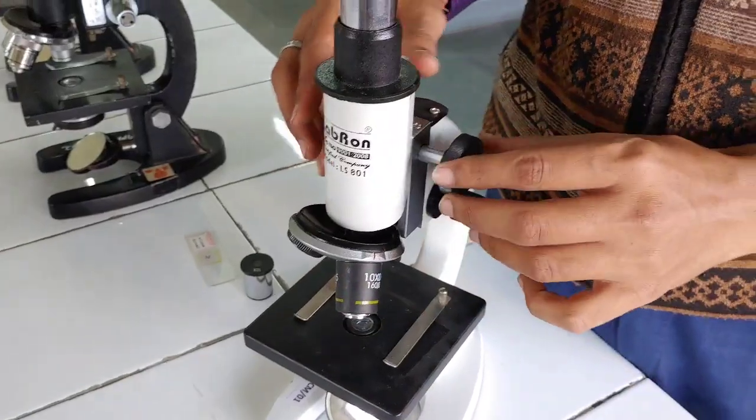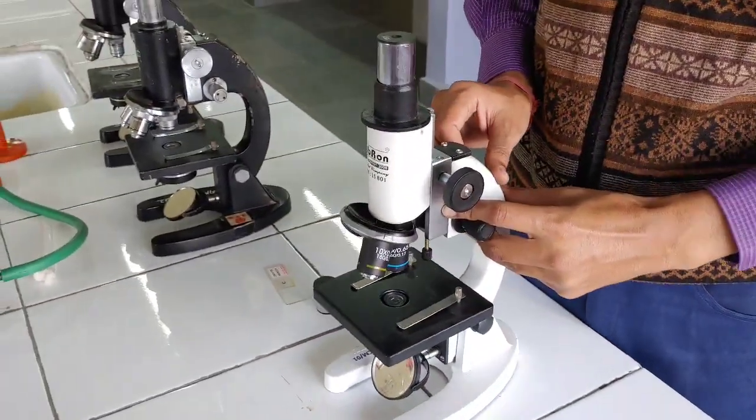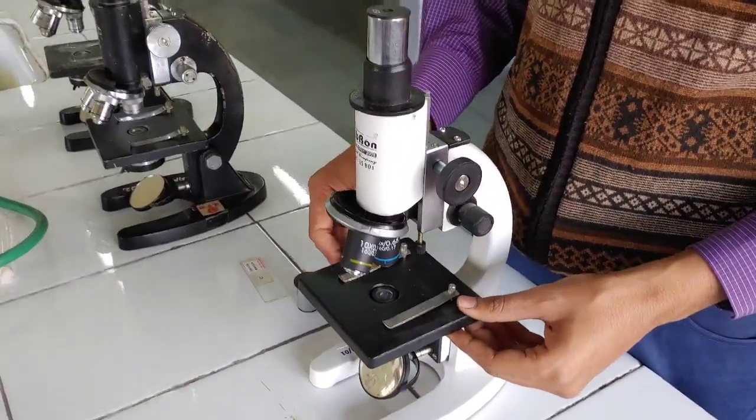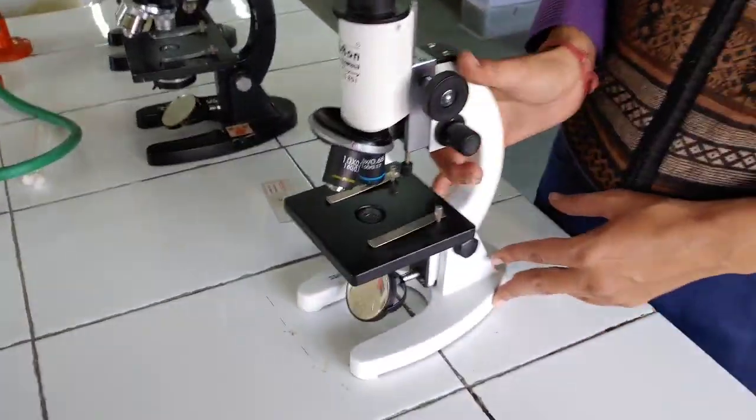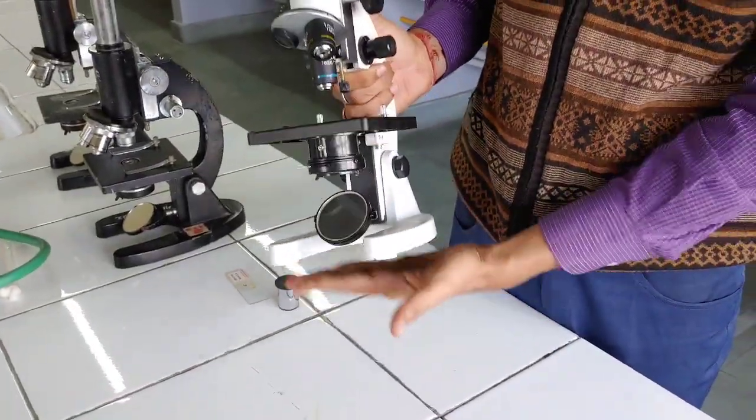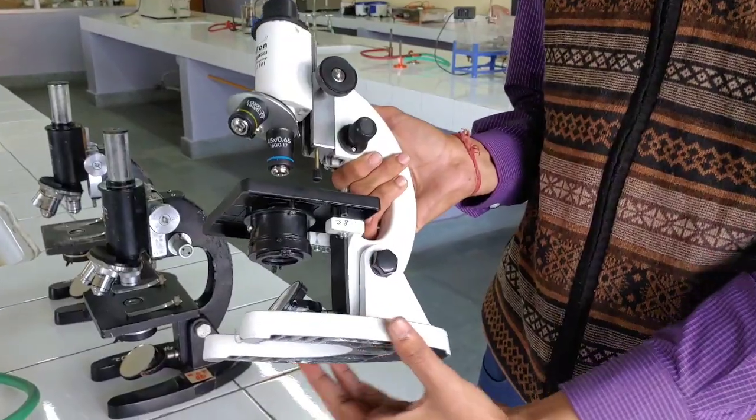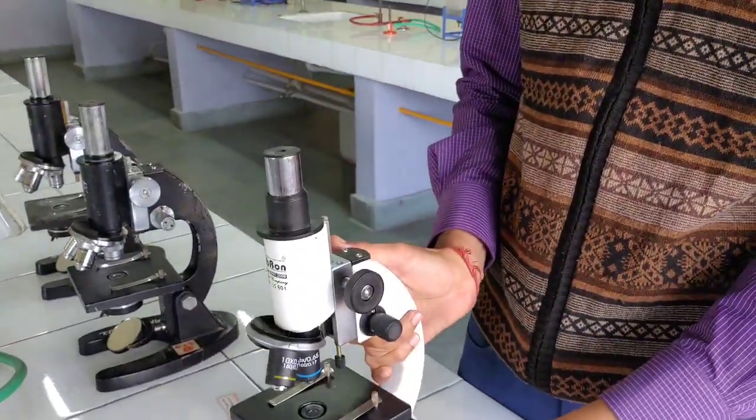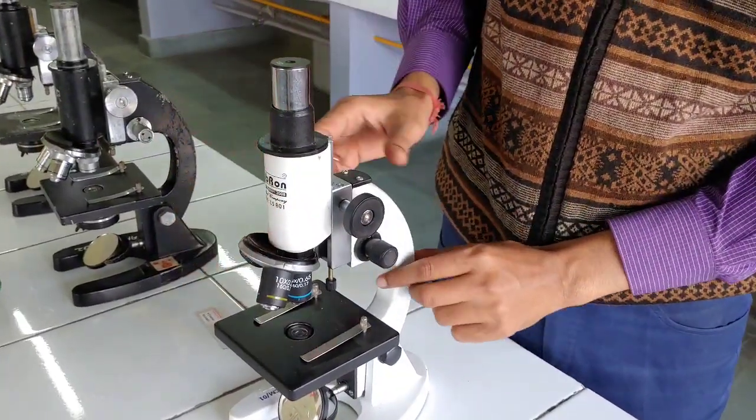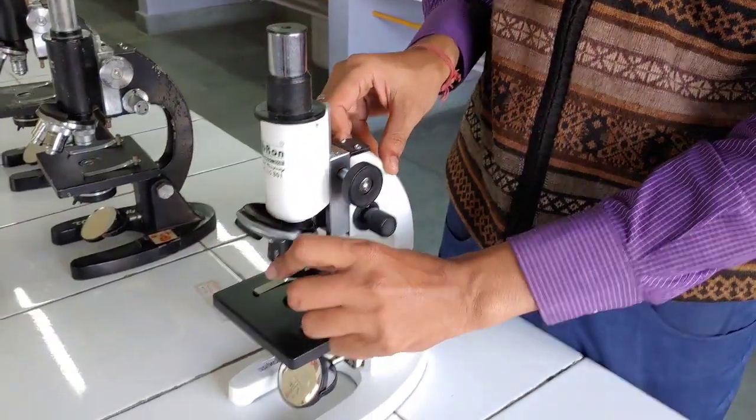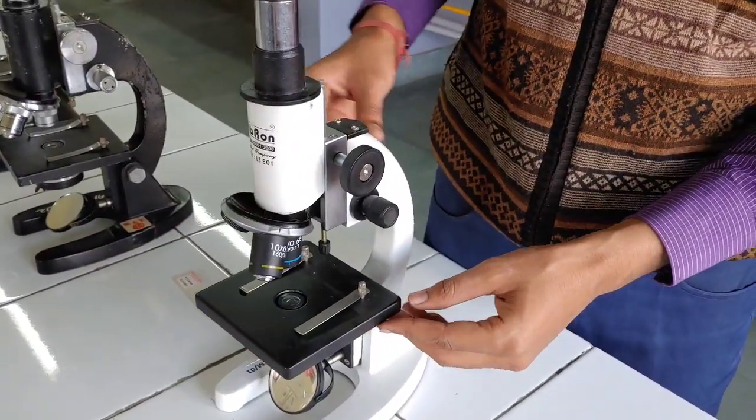So let's see what are the basic parts of the microscope. Now there are four basic parts of microscope. First is the support system. Next is the illuminating system. Next is the magnification system. And last one is the adjustment system.